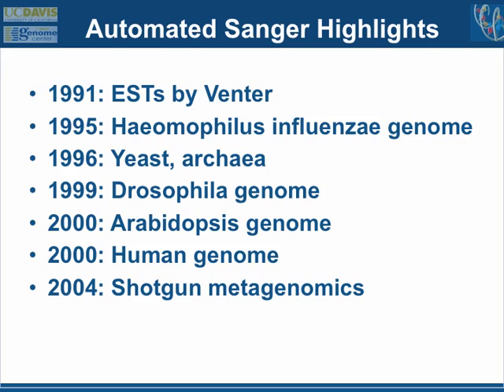And this sort of revolutionized the world of biology by allowing for high throughput sequencing. Most of this was done with what's called shotgun sequencing, where you take a DNA sample, you shred it up, and you just randomly sequence pieces of DNA that come out of that library at the other end. And then you use computational methods to compare the pieces to each other. For example, if you're sequencing a genome, to try and stitch back together the genome sequence of an organism by looking for overlaps between the different pieces.